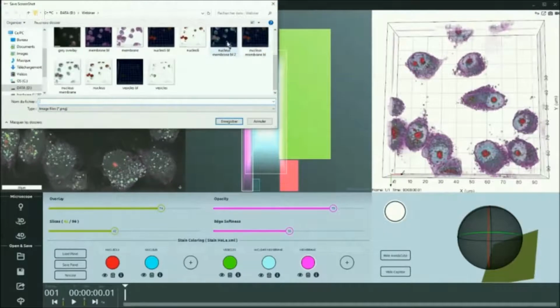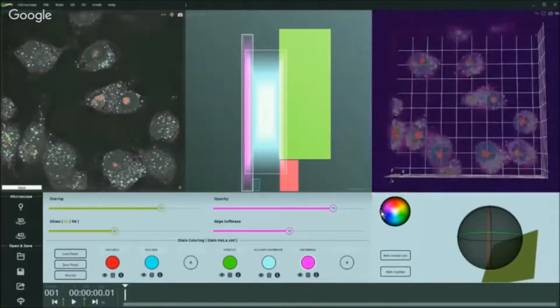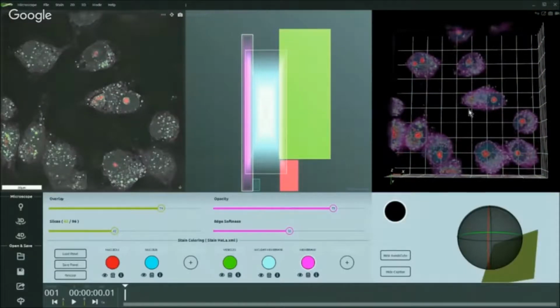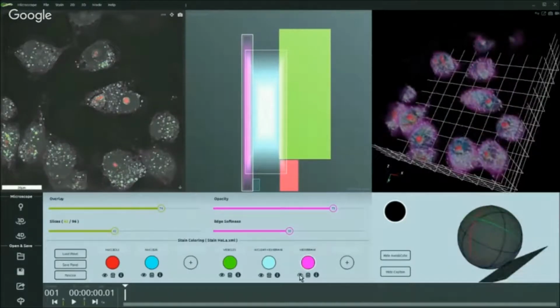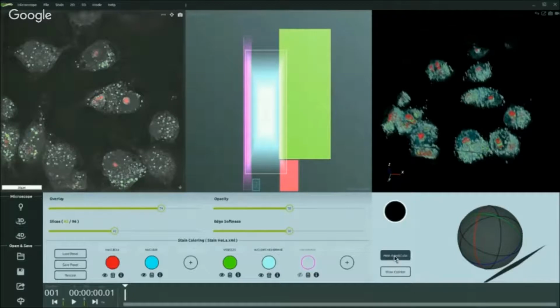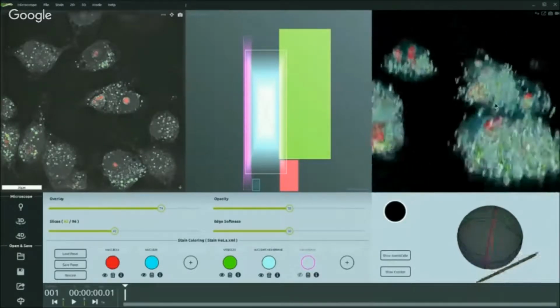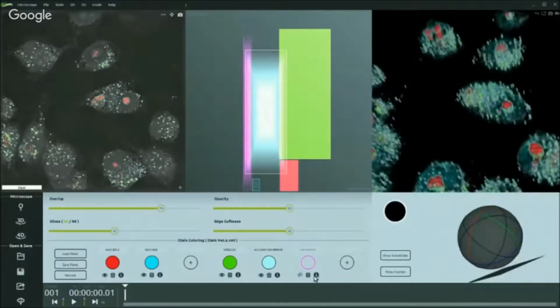Now, as you can see here, probably this is a sneak peek, we can also change the background. So you can go here and select any type of background. And this, probably violet is not the best color, black is cool. You can really produce quite stunning images, highlighting only the part that you're interested in. Let's say that I'm interested in the membrane. You can hide everything and just play with the beauties of the cell. Now, another thing that we find very, very interesting is that you can cut your plane.